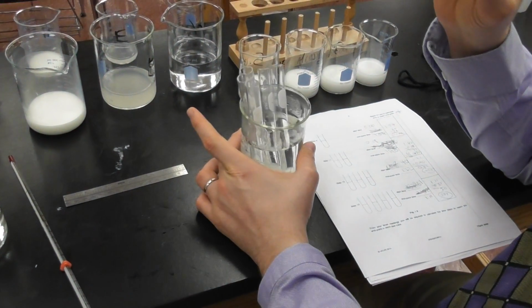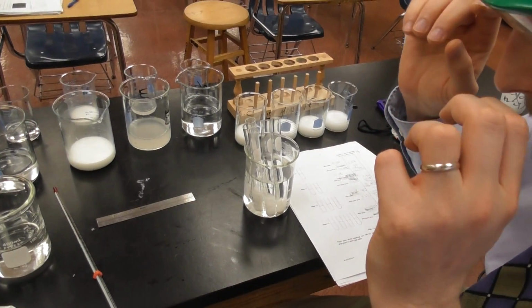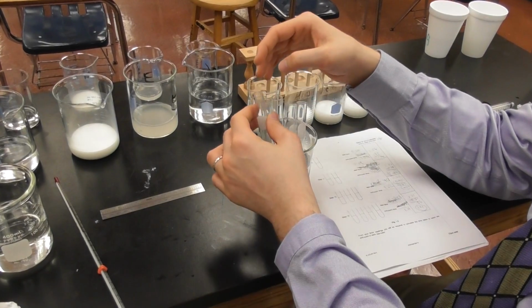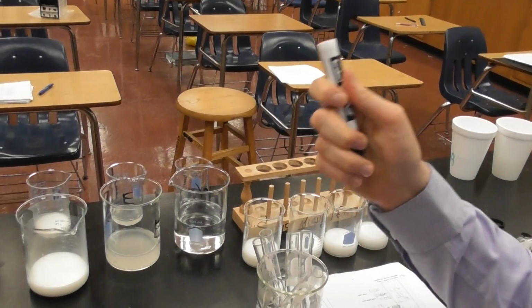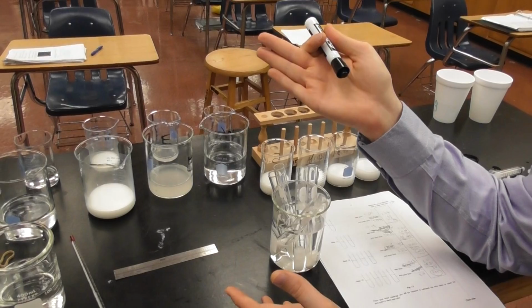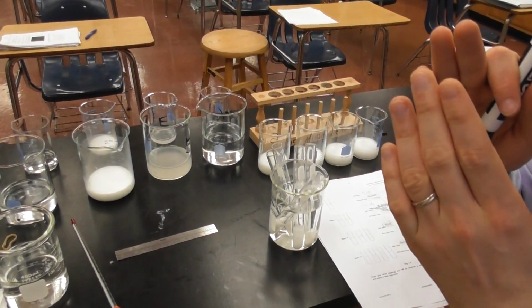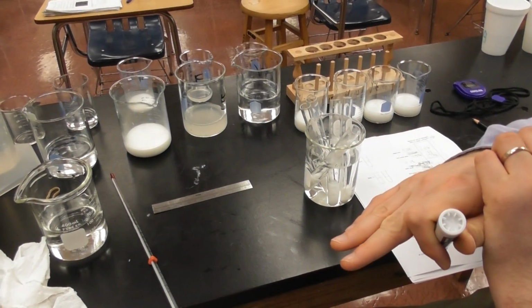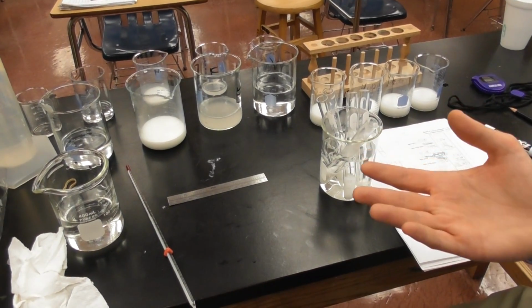Okay, so after a quick edit, here's what happened. I did a sort of a shell game on myself, and I rubbed off the letters because a dry erase marker apparently erases dry. Who knew? And I rubbed off which was which, and also the reaction is really fast, and they turned from pink to white really fast. So I lost track, and I didn't write down my times fast enough. So I just did the reaction again.